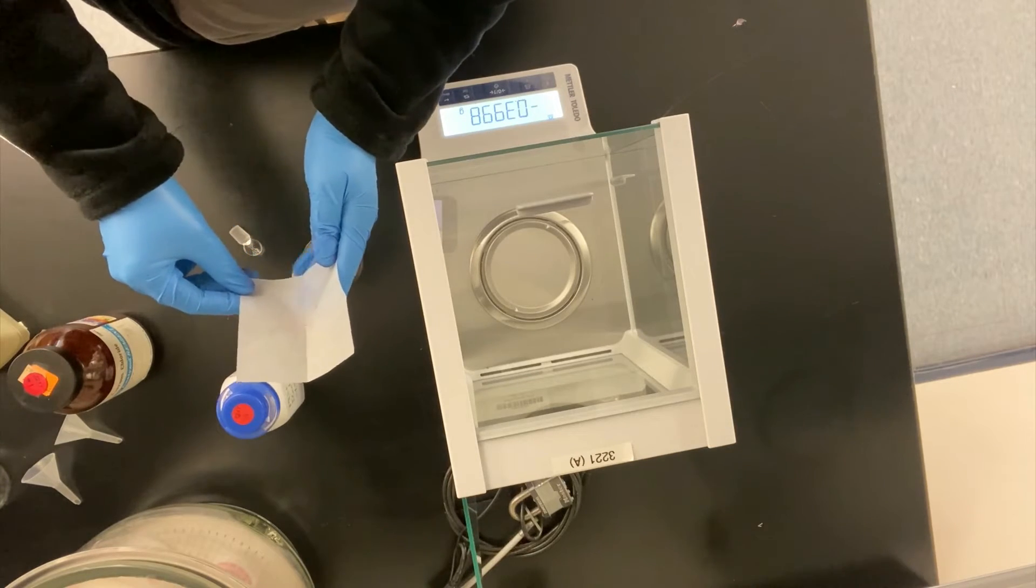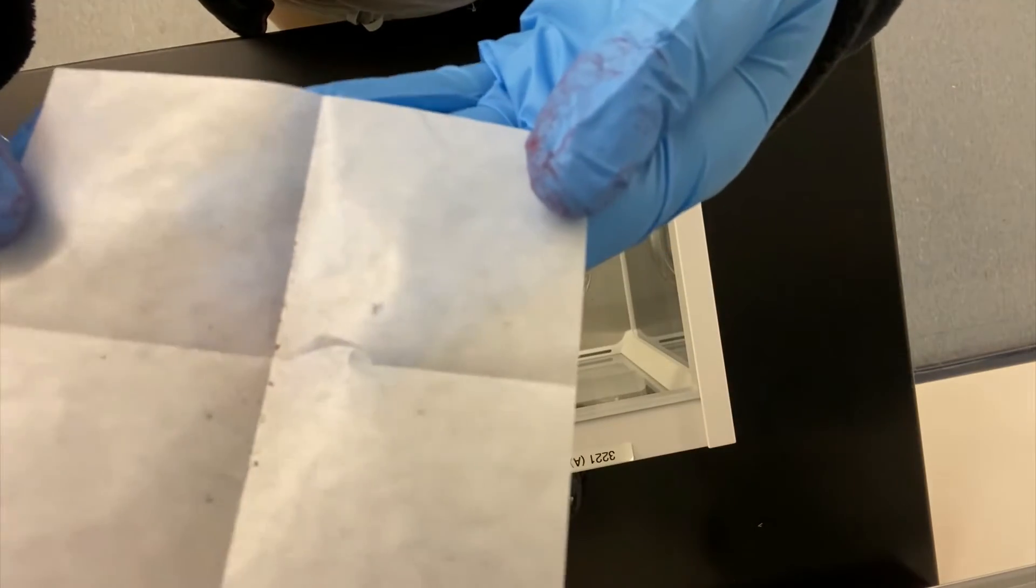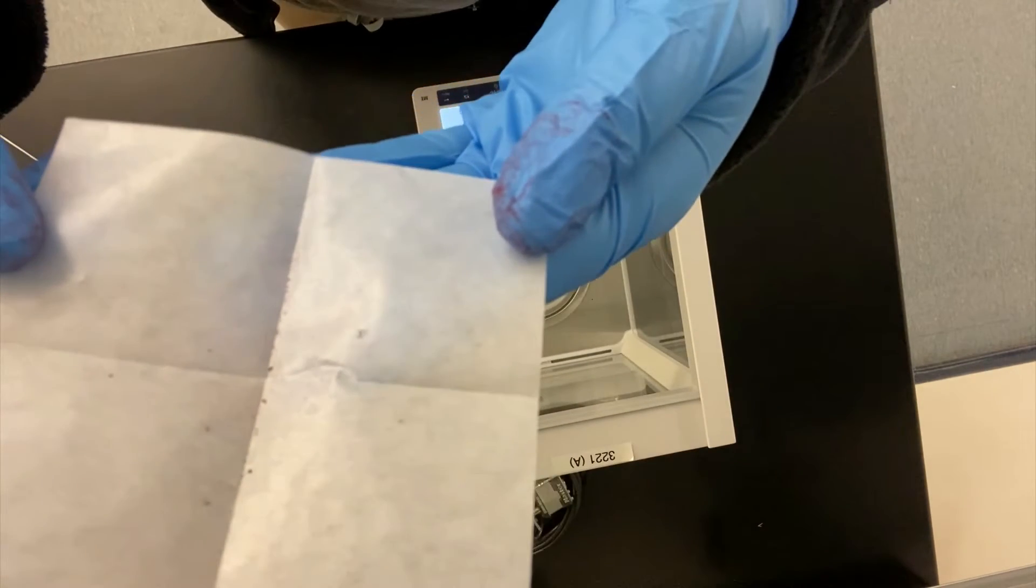After I add the solid to the volumetric flask, it's pretty clear that some of the dye that I weighed out is still on the weighing paper. The reason I used dye for this demonstration is that you can see the particles that are left behind. If I were weighing out a white solid on white weighing paper, you wouldn't see the residue, but it would still be there.